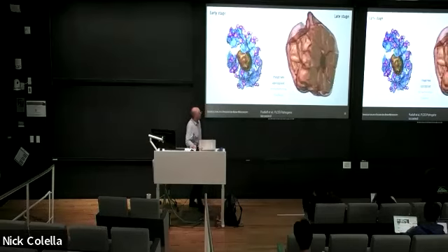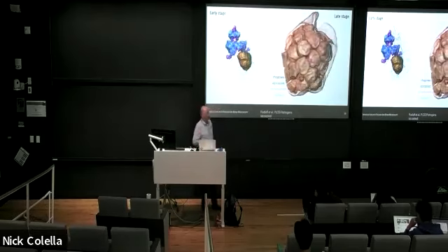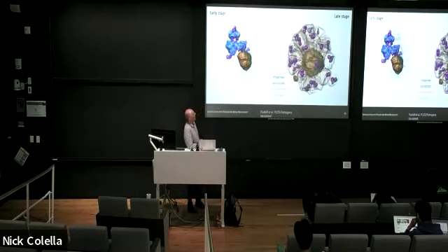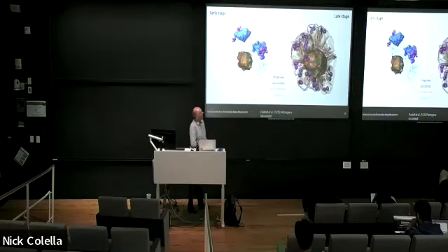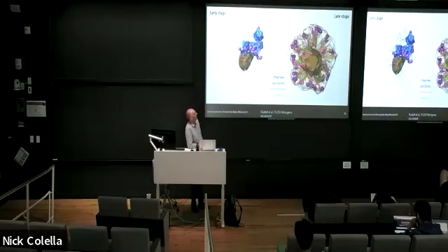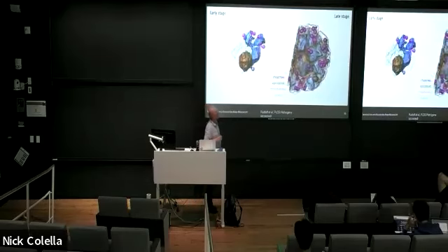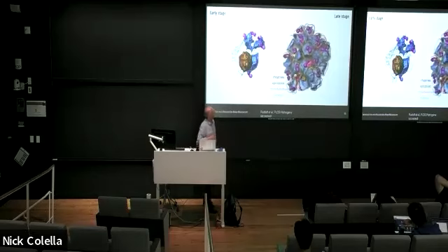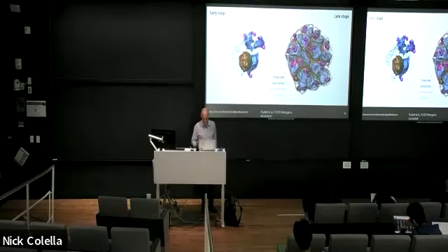And so this here is now a corresponding volume at a later stage in the development, where you can already see all the daughter cells have been evolved. The different organelles have been nicely distributed within the daughter cells, and the whole evolution has finished, and this parasite is ready then to break free out of the blood cell.